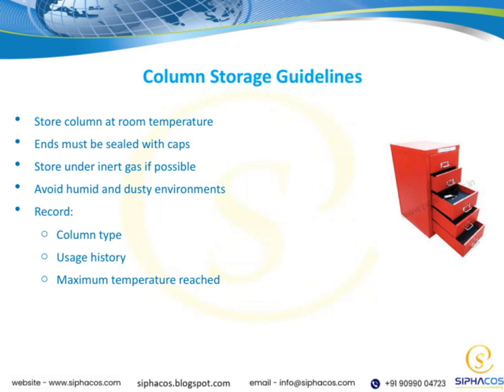If possible, storing the column under an inert gas like nitrogen can offer extra protection, especially for sensitive samples. We also want to avoid humid and dusty environments, as these conditions can negatively impact the column's performance and longevity.